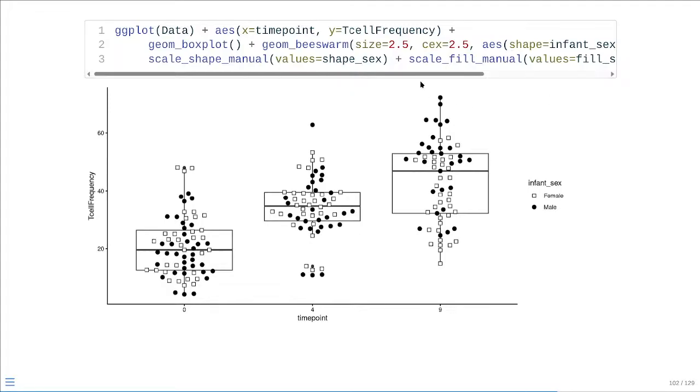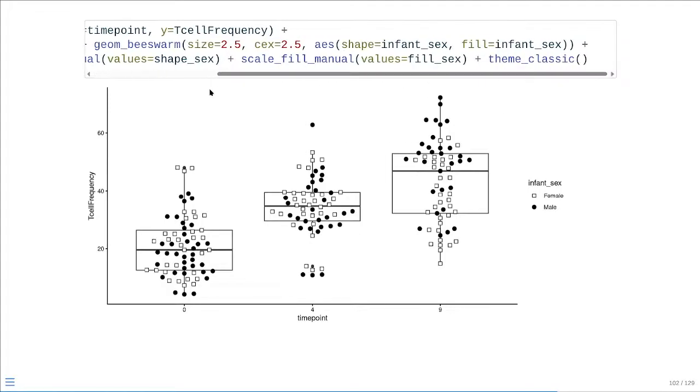As we can see right now, we've switched it out. We no longer have that ugly gray background. We have the plus theme_classic, which is applying the classic theme look to everything. As you can see, the font and the number size has changed a little bit on the axis. We don't have that upper or right border anymore. Everything has been changed out a little bit.